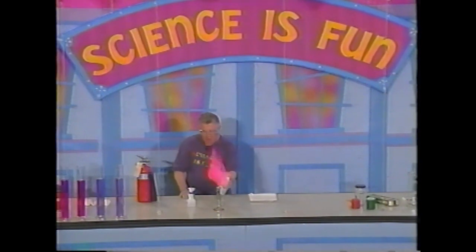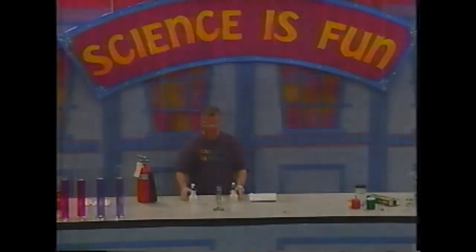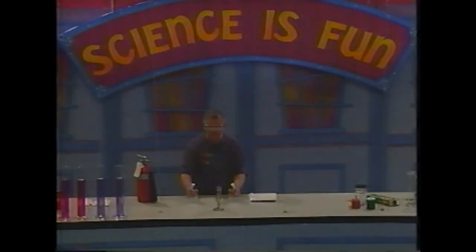Here we go. Can you see that? Let's turn the lights down to see if we can see it better. All right, with the lights down, now you see a blue flame, and if I spray this liquid into it, and I'll spray another liquid into it, and let's do it together. Okay?